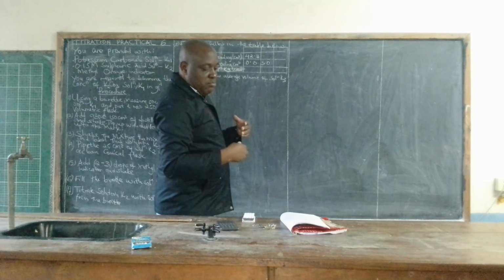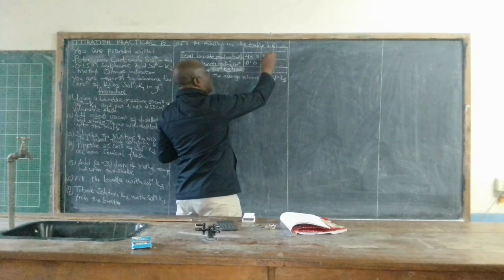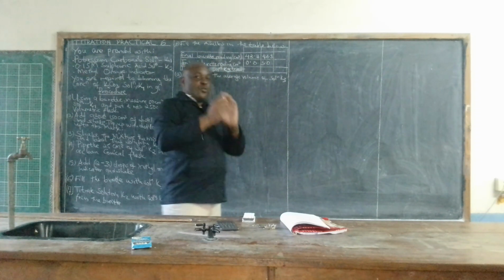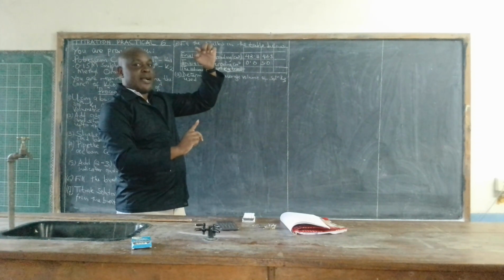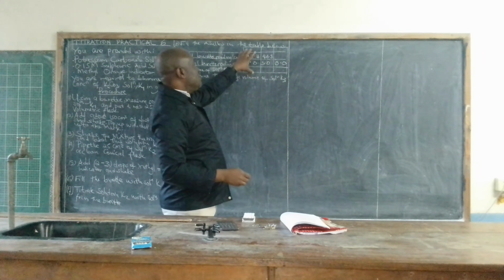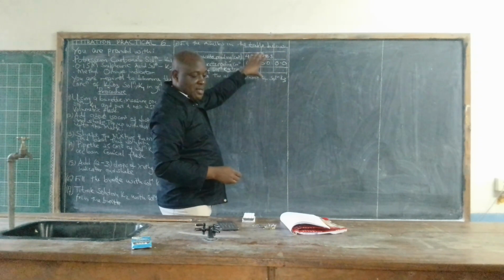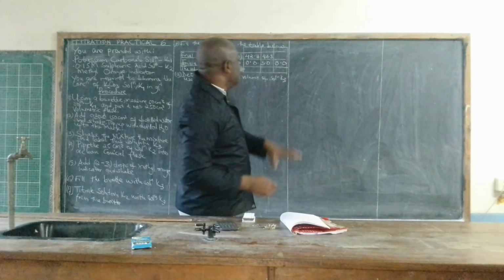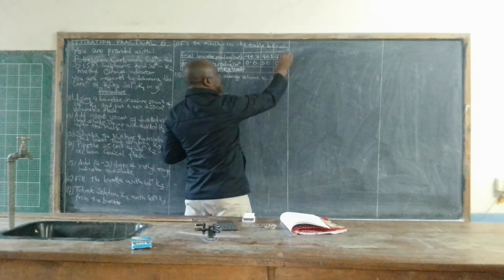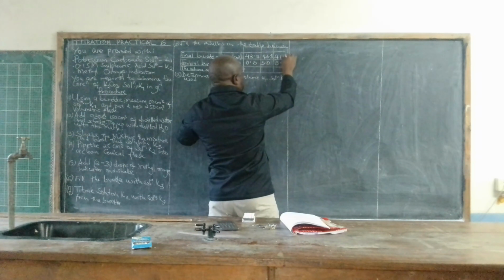So we assume now we have titrated and then it has changed to 46.8. Then we refill the burette again. Maybe we say we have refilled the burette up to the 0 mark. So we come and write here 0.0. And make sure all your tabulated results are to 1 decimal place. That is the law of titration. So let us now assume that we have titrated and then it has changed to 41.8, somewhere there.